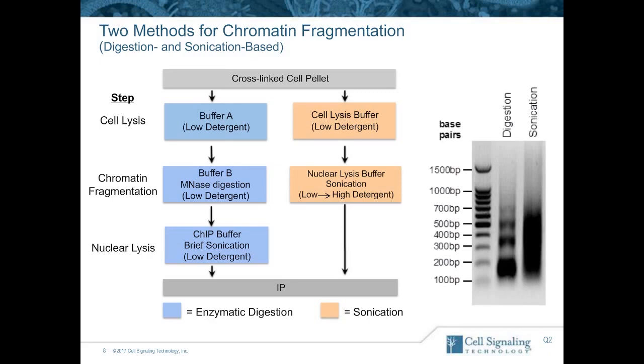So in orange on the right is shown the sonication protocol. Here we do a cell lysis in a low detergent buffer, and then we sonicate the chromatin, and we use acoustic energy to sonicate the chromatin into small fragments.